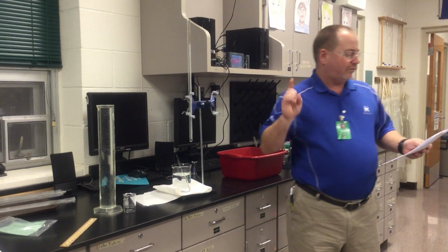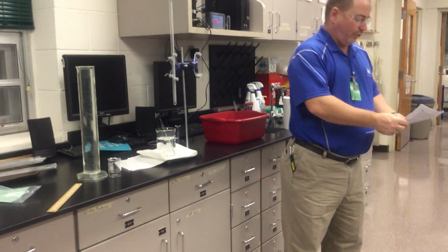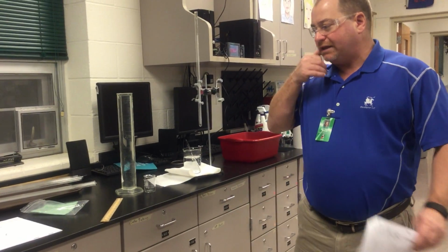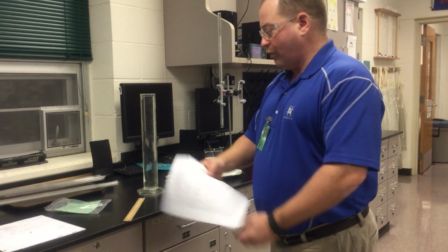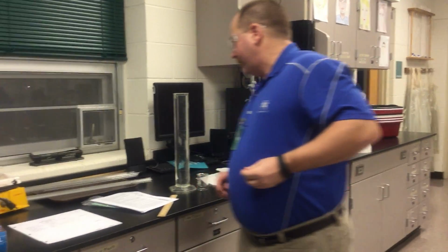I can tell you right now that the length of your magnesium ribbon is 19.5 millimeters. So you need to write that down for trial number 2. Your magnesium is 19.5 millimeters. Roll the magnesium into a loose coil and tie it with a piece of thread.